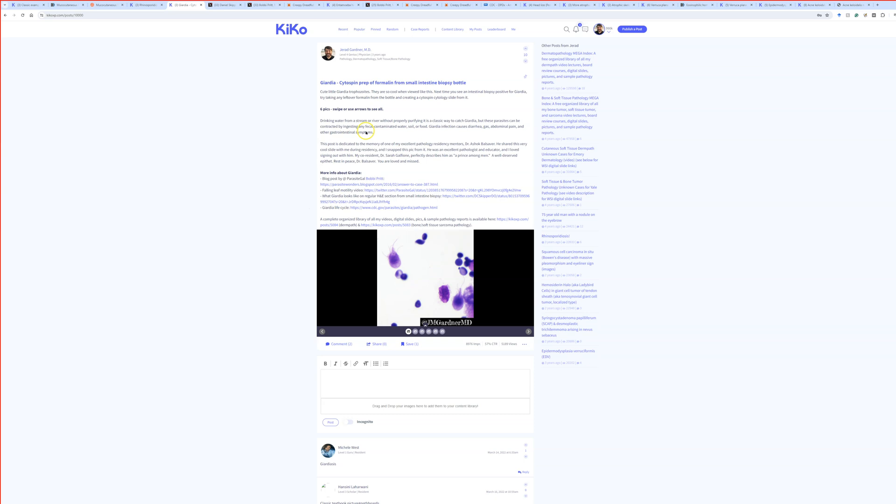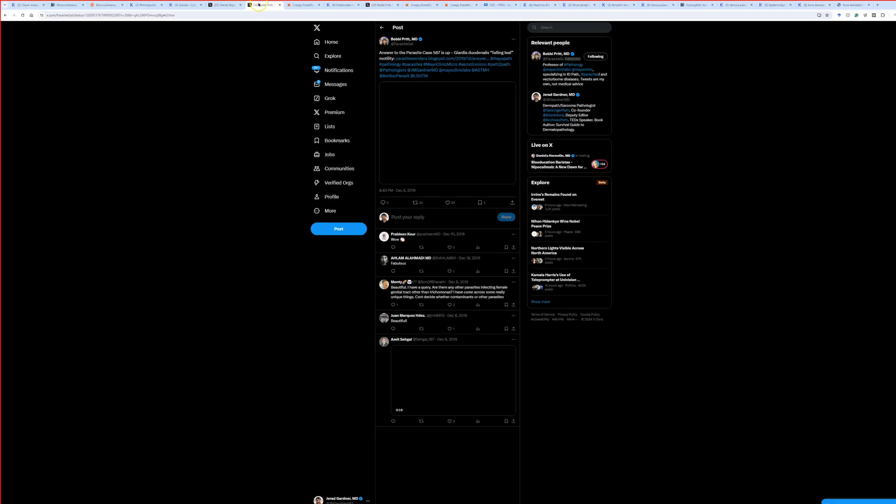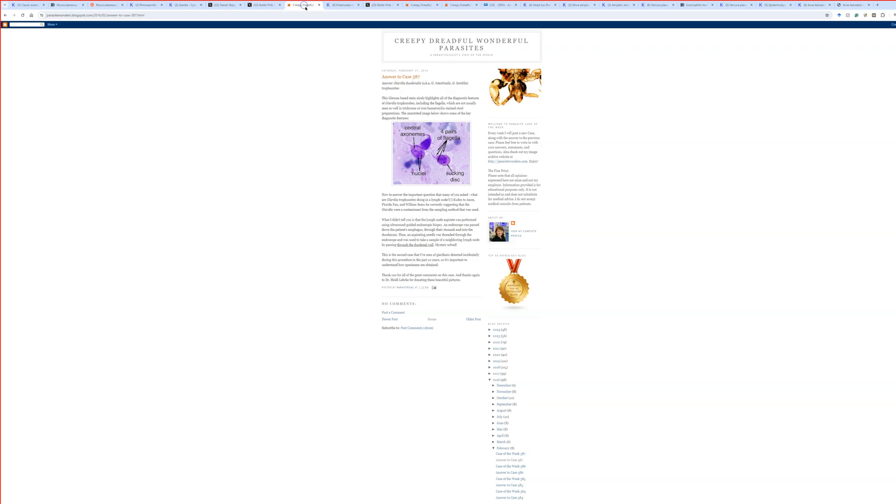So this is why we don't like to drink stream water because you do not want to get this because it's bad diarrhea and cramping and gas and abdominal pain. All right. But they sure are cute, aren't they?